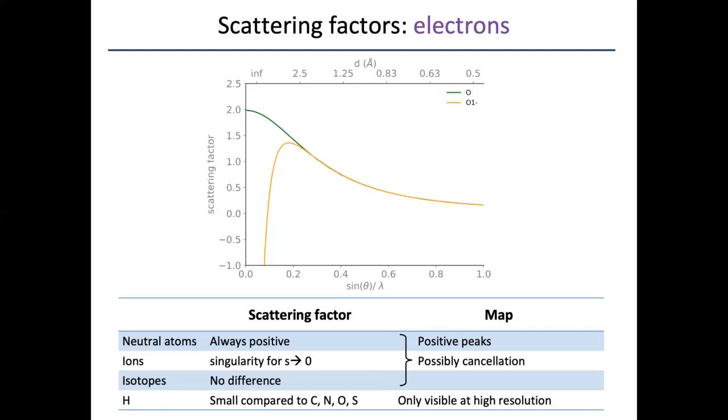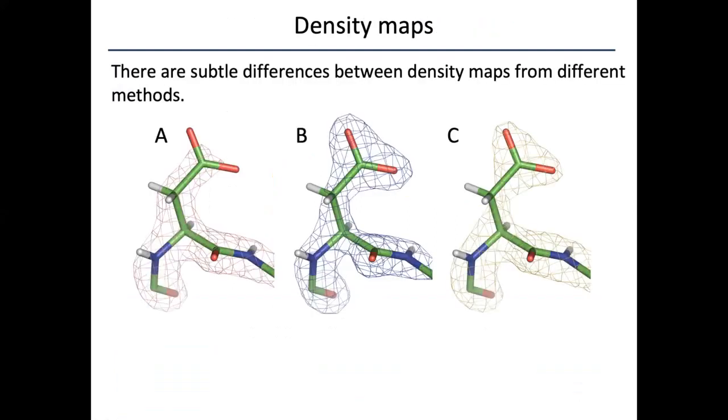So knowing all this, we can now determine which of these maps corresponds to which experiment. So I want to give you maybe a minute to think about it, and maybe you can put some suggestions in the chat, or I guess the chat is not the fastest if you want. So for example, A is neutron, B is X-ray, C is electron. So I invite you to give it a try and try to figure out which of these maps corresponds to which experiment.